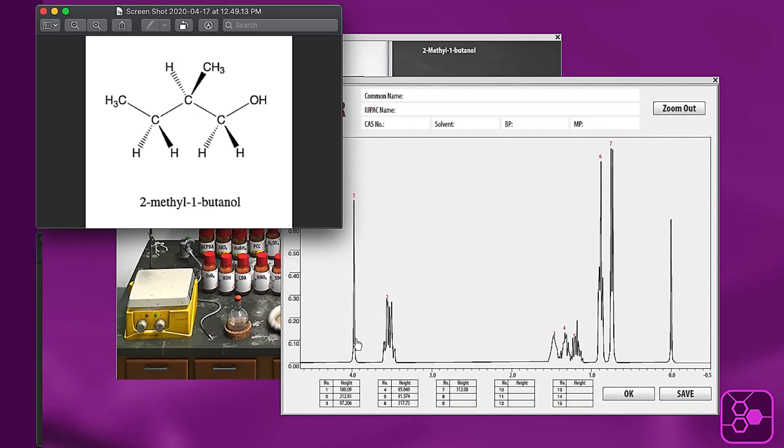Now this is where these heights come in handy. So you can see here peak number one has a height of about 100. We know now from our initial assignment that the hydroxyl proton is a single proton for this height, and so a height of about 100 or an integration of about 100 corresponds to one proton. And this is a good example because 100 is a pretty nice round number. You can look quickly at the other peaks and just do a quick comparison.